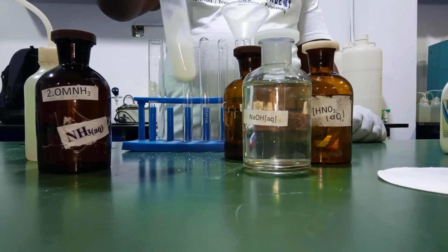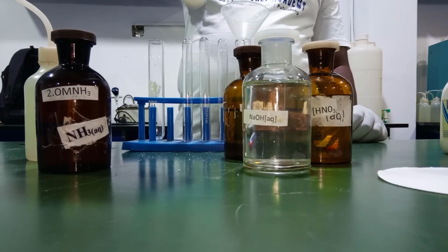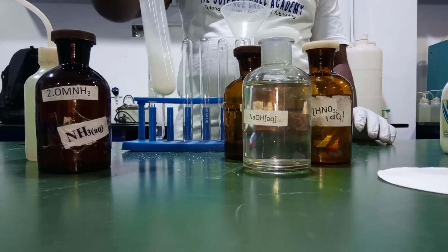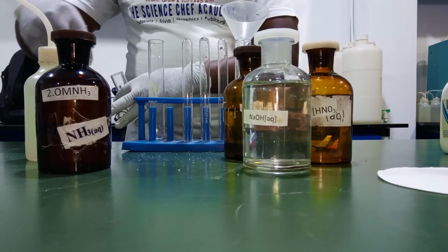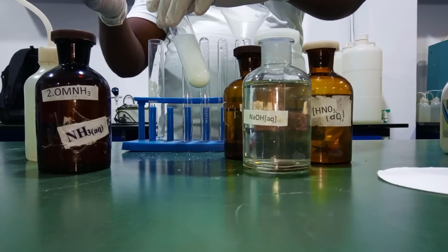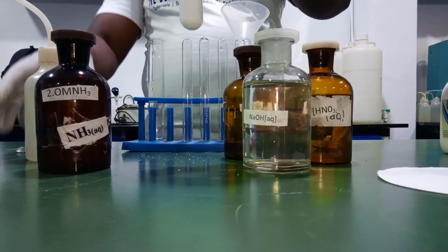Of course, it will not dissolve. You don't expect to get a clear solution because of the precipitation, right? So since we are expecting a precipitate, I would advise that we add more salt so that we have enough residue to work with.